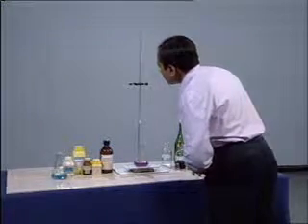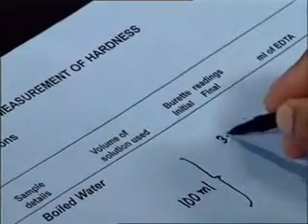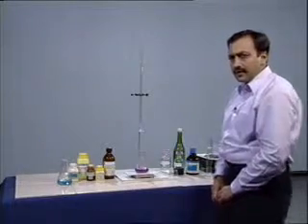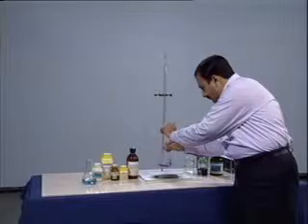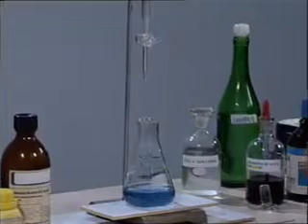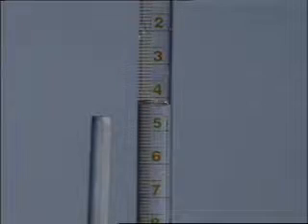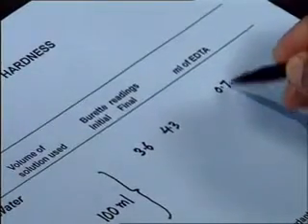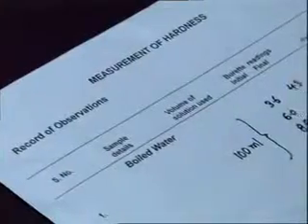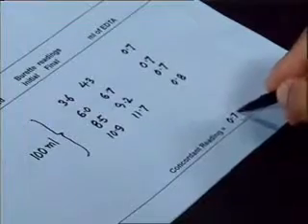Note down the initial reading. Titrate the sample till the blue color appears. Note down the final reading. Find the volume of EDTA used. Repeat the process till we get concordant value. The concordant reading is 0.7 ml.